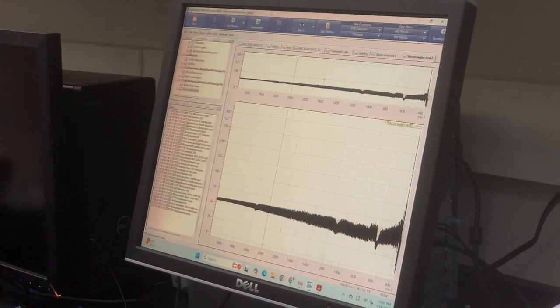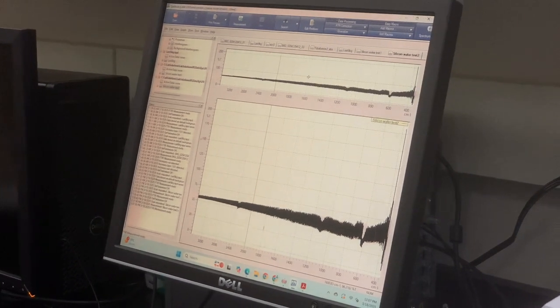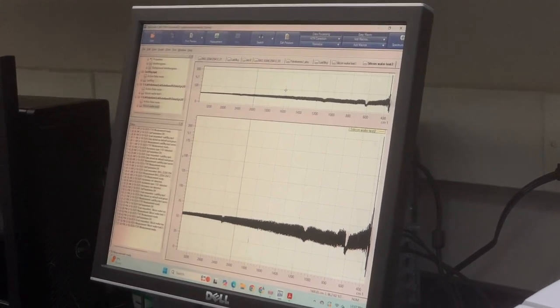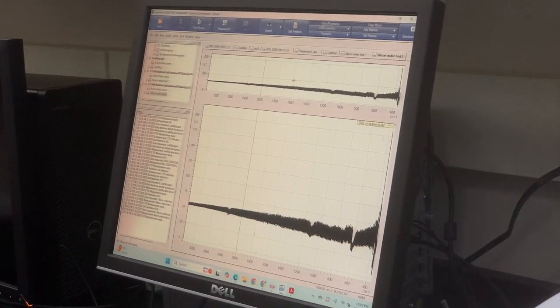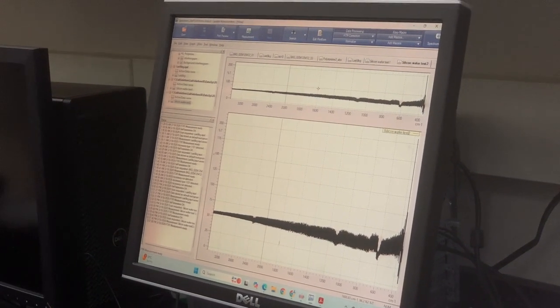So we mix those inks together and deposit. But for publication purposes, you always need to characterize the ink to show the audience what it is. Absolutely. That's why we always need to characterize the ink material. That makes sense. I'm pretty sure there are some application notes for it. I don't see why you can't use the integrating sphere that we're receiving.